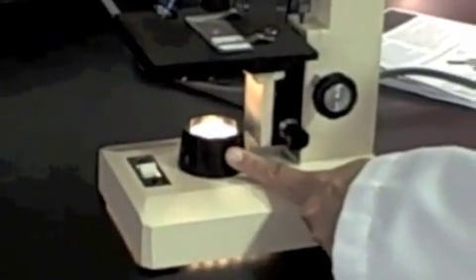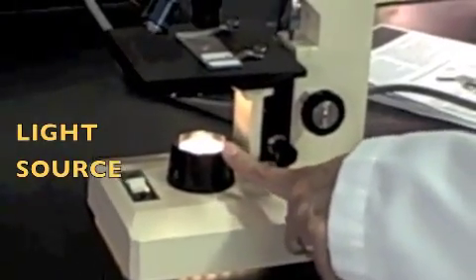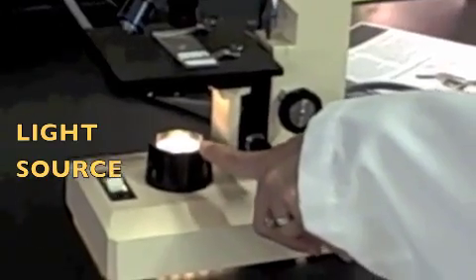Okay, so tell your partner the name of this piece right here. That's the light source. See the light coming out? Remember, this is a microscope that's powered by electricity. What's the name of this piece right here? Good, that's the diaphragm.